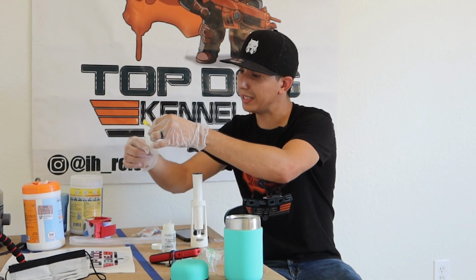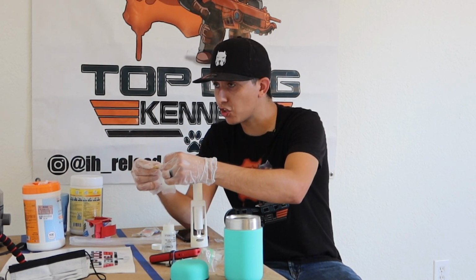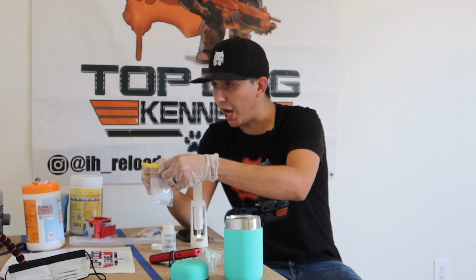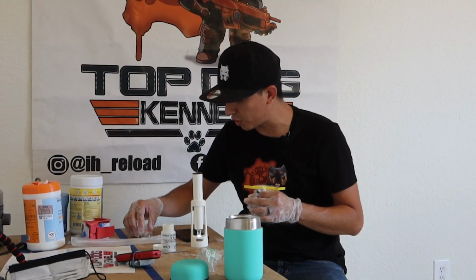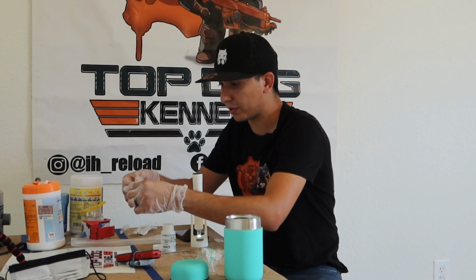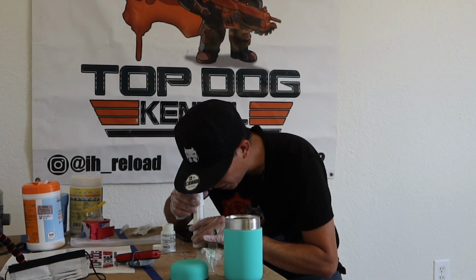Make sure everything's nice and mixed. You open it one more time. And what we're gonna do now, we're gonna make sure that the sperm wasn't shocked when we mixed it with the extender. So you open up the bag, you're gonna put your sample on a slide yet again, and then you're gonna put that underneath the microscope, and you're gonna make sure that the sperm is alive, well, and moving.